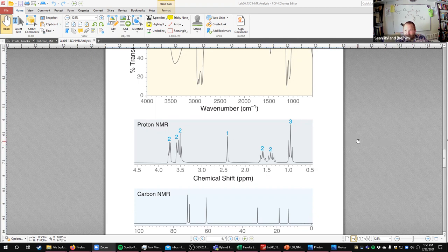Most stuff like that, most toxicology these days, is all done with dry chemistry with instruments like this. So yes, you're losing out on some of the historical aspect of it, but what you would actually be doing if you got a job as a toxicologist or as a medical examiner would be looking at spectra like this these days, unless the power goes out.